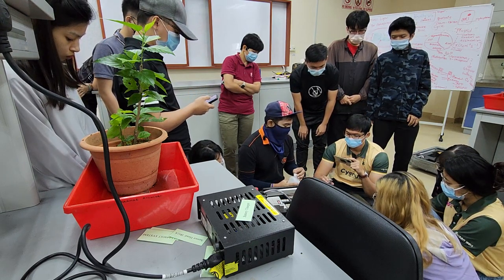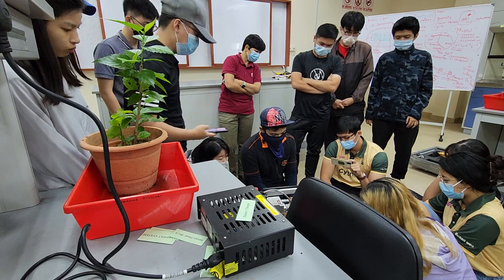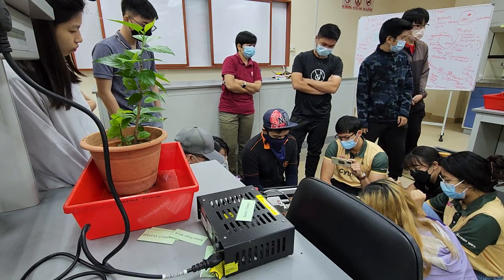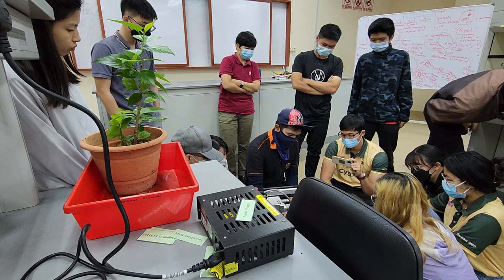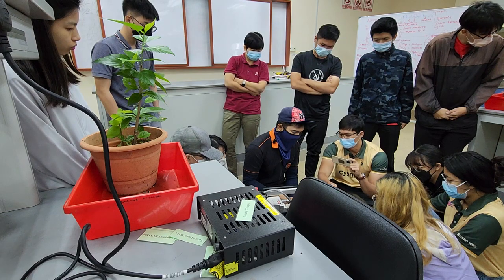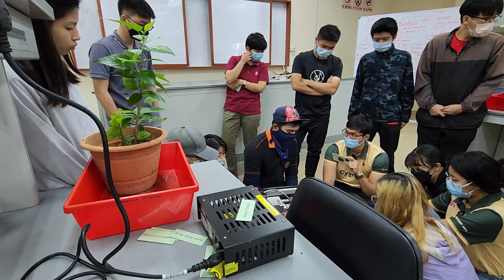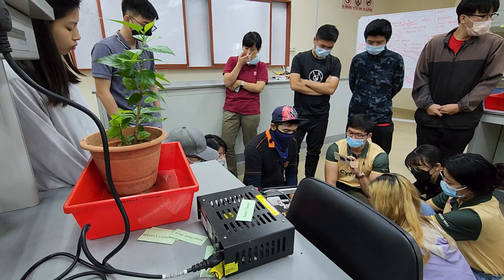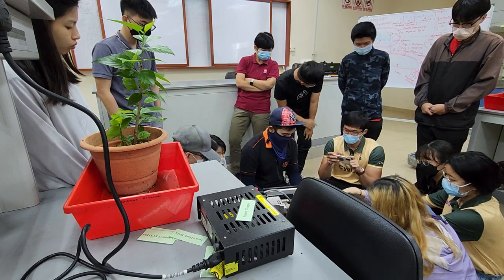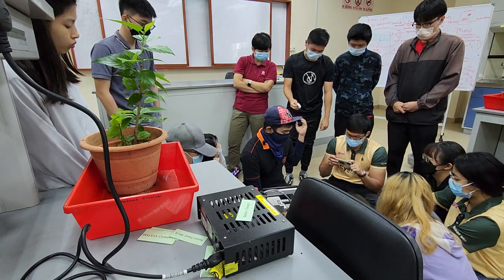Anybody want to fill this in? Put it back. Yeah. How do we know whether it is in a bad state? Look at the reading. I mean, we need to change the whole thing. Not like this, we can mix a little bit. This thing better change the whole thing. Close it. Put it back. Tutup lah. Oh, ini dari manufacturer. I don't know.